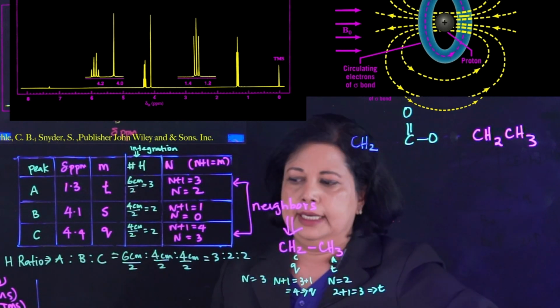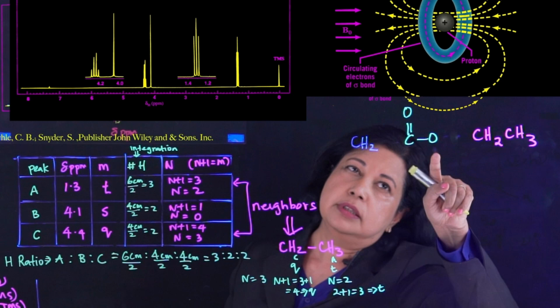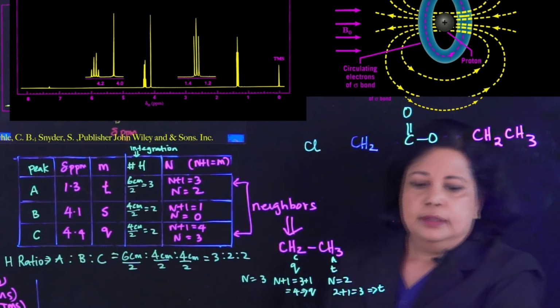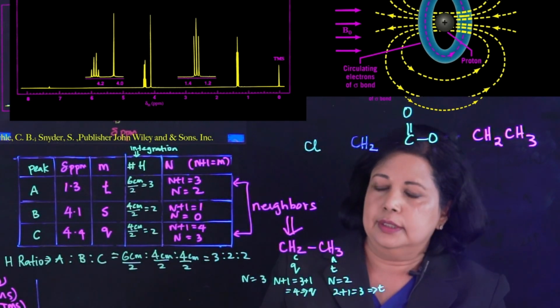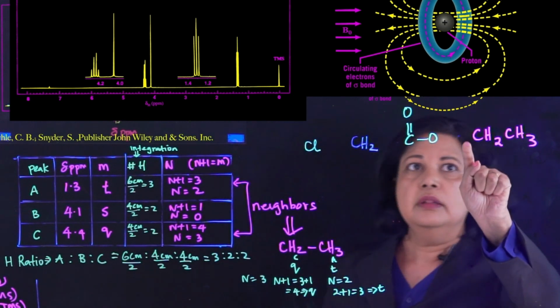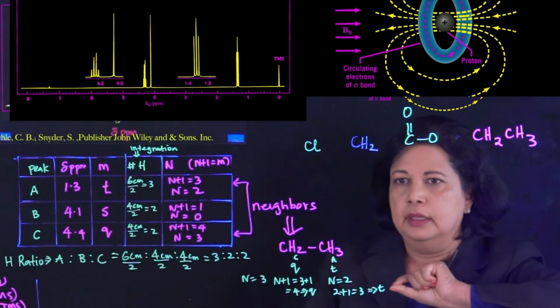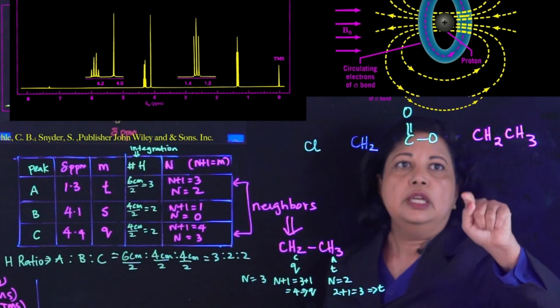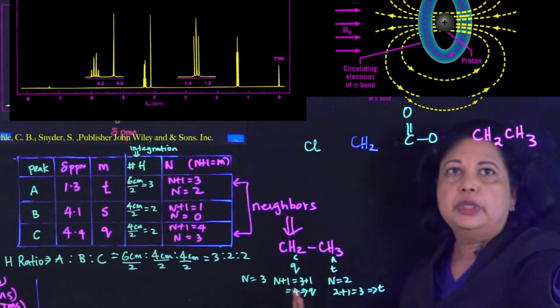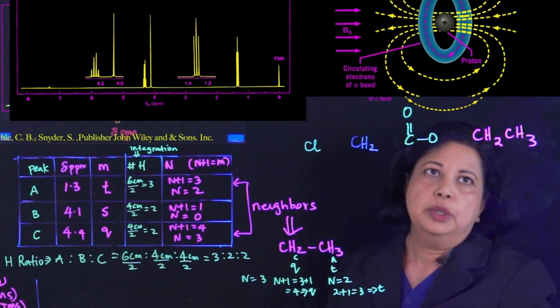And we also have, in addition to that, a chlorine. And where can the chlorine go? Well, there aren't too many places. We cannot put it anywhere here. Oxygen, chlorine, well, what about here? So that's a likely possibility. NMR doesn't really leave us with too much room for choices because it tells us exactly the order in which these are arranged. So for the ethyl, let's look at the chemical shift to see if it should be connected directly to the oxygen or directly to the carbonyl. We saw earlier in the chart, and you can refer to that, if you're connected directly to an oxygen, that's very de-shielding, and it's going to be between 3 and 4 for these hydrogens. If it's connected to the carbonyl carbon, it's going to be between 2 and 2.5.